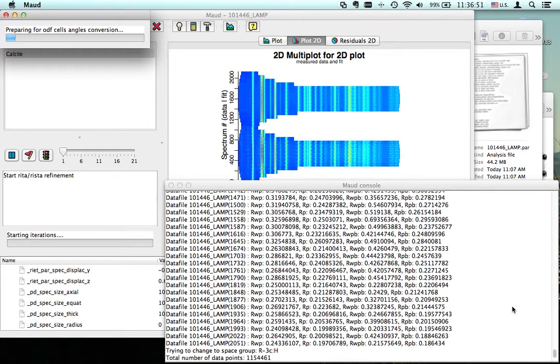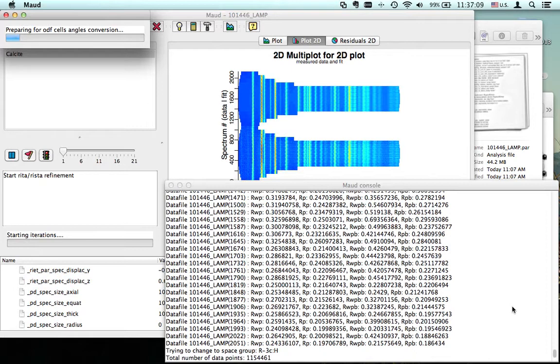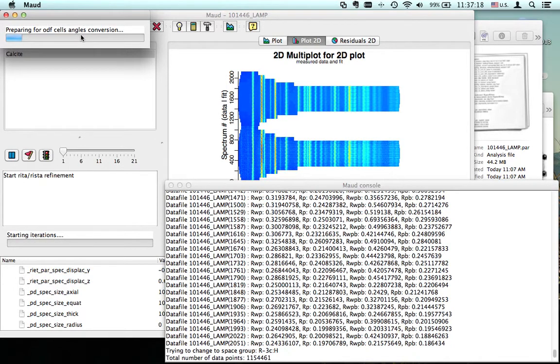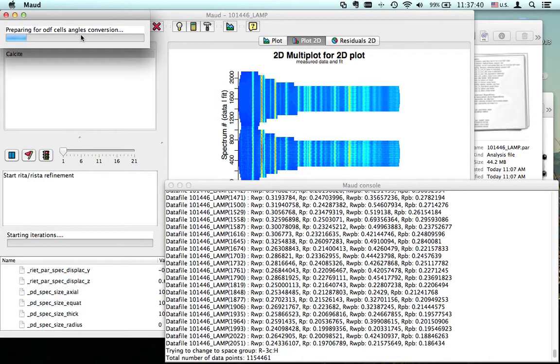Luckily, this will be only once for every iteration. We have one iteration that will be done at the beginning plus one after the first iteration, so this will be two times. This ODF cell angle conversion depends on how many points you have, how many reflections. We actually limited the reflections using the 0.7 and the 5%. If you put, for example, you limit the intensity of the reflections to over 0.1—10%—you will cut a lot of the reflections and it will go much quicker in the computation.